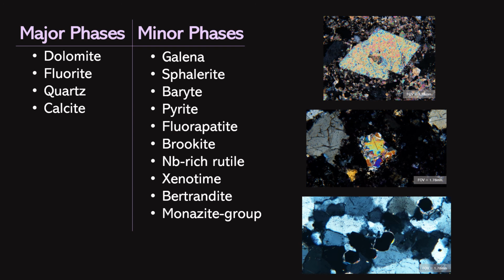The overarching goal of this project is to create a mineralogical setting for a larger chlorine isotope study that would try to find the origin of the fluorine in the system. As for my next steps, I hope to get these thin sections carbon coated so that they can be looked at under a scanning electron microscope, because I want to get a better idea of the chemistry in the minerals and to continue identifying minor phases, with fluorocarbonates and rare earth phosphates being of particular interest.